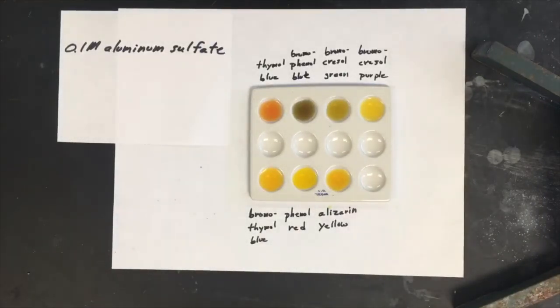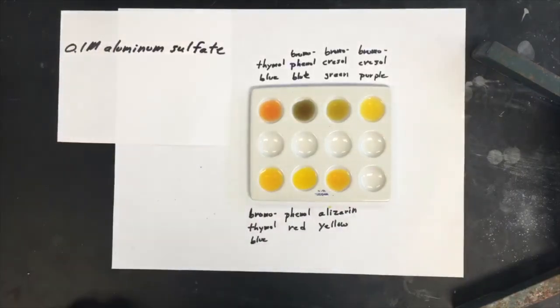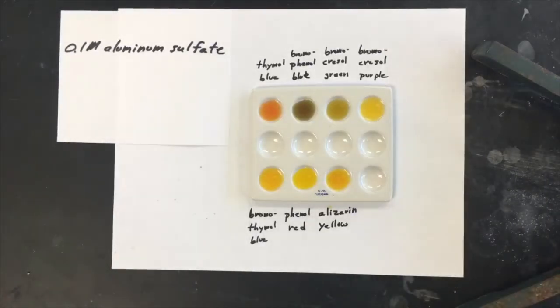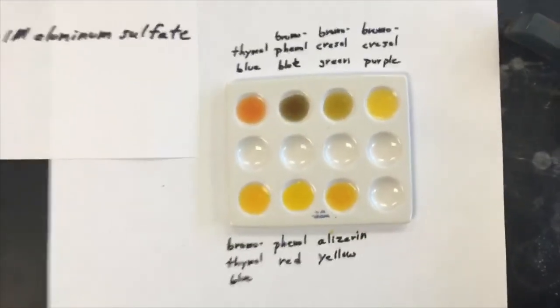Here's the last, or the next to last solution, excuse me. It's 0.1 molar aluminum sulfate. And here everything has been combined and mixed up. And let me zoom in so you can see a little closer what the colors are like.